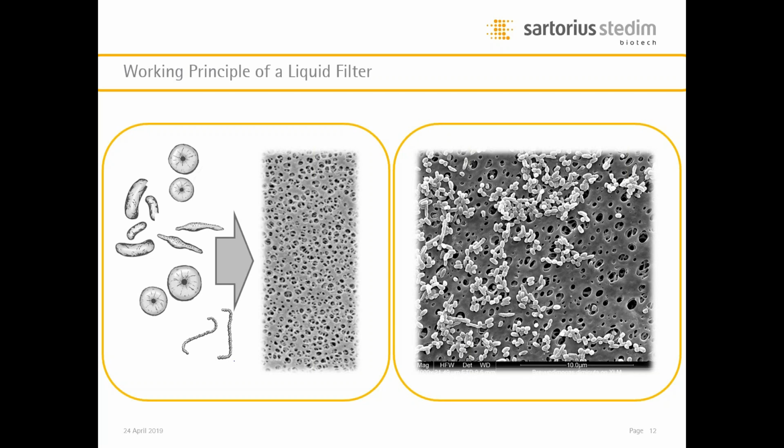And this is exactly the burden we put on such a membrane, and only when it is guaranteed that not a single one of those microorganisms will ever have a chance to be released from the downstream side of the filter, then we as a supplier are allowed to call this membrane a sterilizing grade filtration membrane, and the product a sterilizing grade filter. So this is really important to understand.